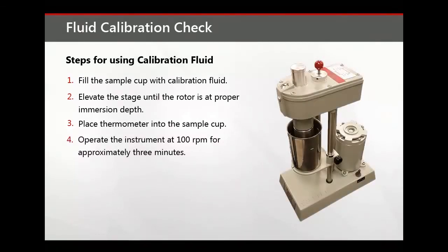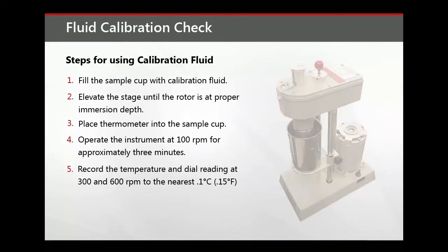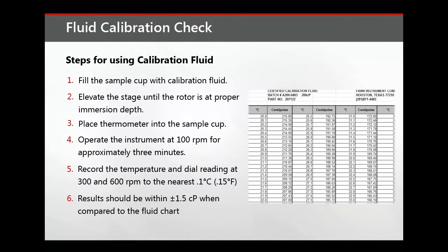Operate the instrument at 100 RPM for approximately 3 minutes. This will equalize the temperature of the bob, rotor, and the fluid. Record the temperature and dial readings at 300 and 600 RPM to the nearest tenth of a degree Celsius or fifteen hundredths of a degree Fahrenheit. Results should be within plus or minus one and a half centipoise of the viscosity value on the fluid chart at the recorded temperature noted.